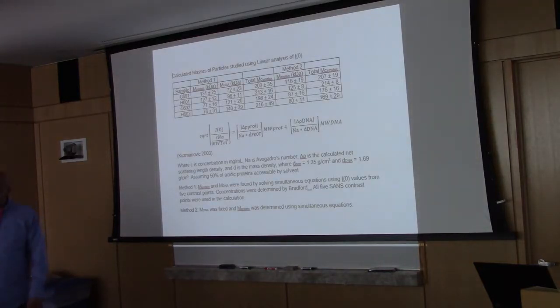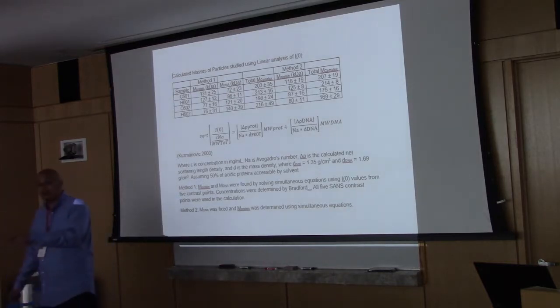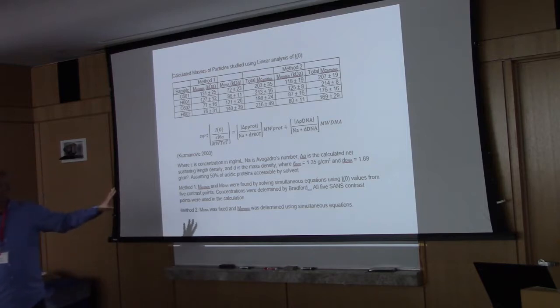At first, we thought, oh my gosh, these numbers don't make any sense. When we went back in the notebooks and looked at our Bradfords versus our nanodrops, we found that one was 30% off from the other. We had to do a correction to account for that deviation. So be very careful. Again, concentration, especially with neutron scattering, you have to get it right. Otherwise, you're going to lose out on a major part of these analyses with regards to deriving mass and molecular volume.